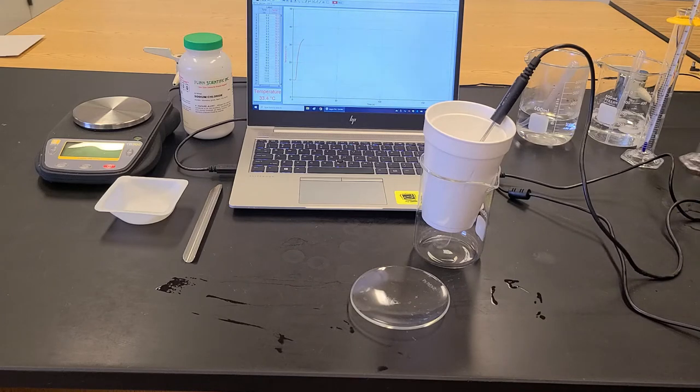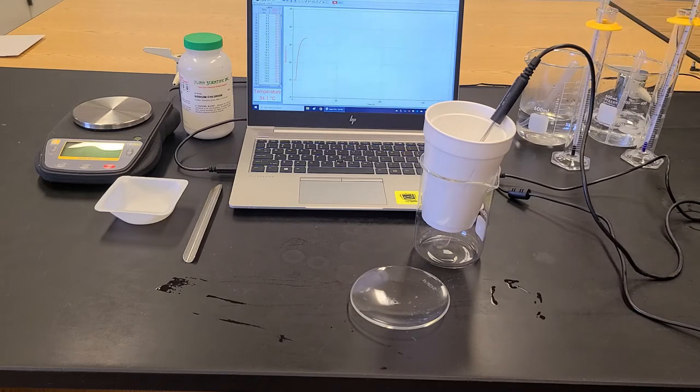So I'm going to go ahead and just make sure that my water is well mixed, that they're both coming to the same temperature here. And basically I just want to wait until my temperature stops changing until it becomes constant again.